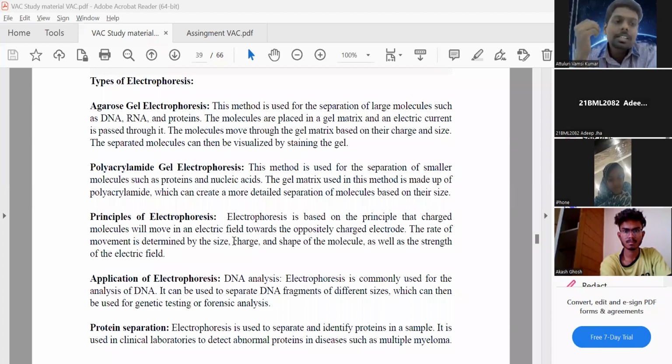In the starting days, during non-availability of electrophoresis, we used a traditional approach called Sanger sequencing. Sanger sequencing is really painstaking. Just for knowing a 200 base pair sequence, it needs almost 1 week of intensive lab work. But today we are able to sequence at high speed. Even the entire human genome can be sequenced in a matter of days, actually.